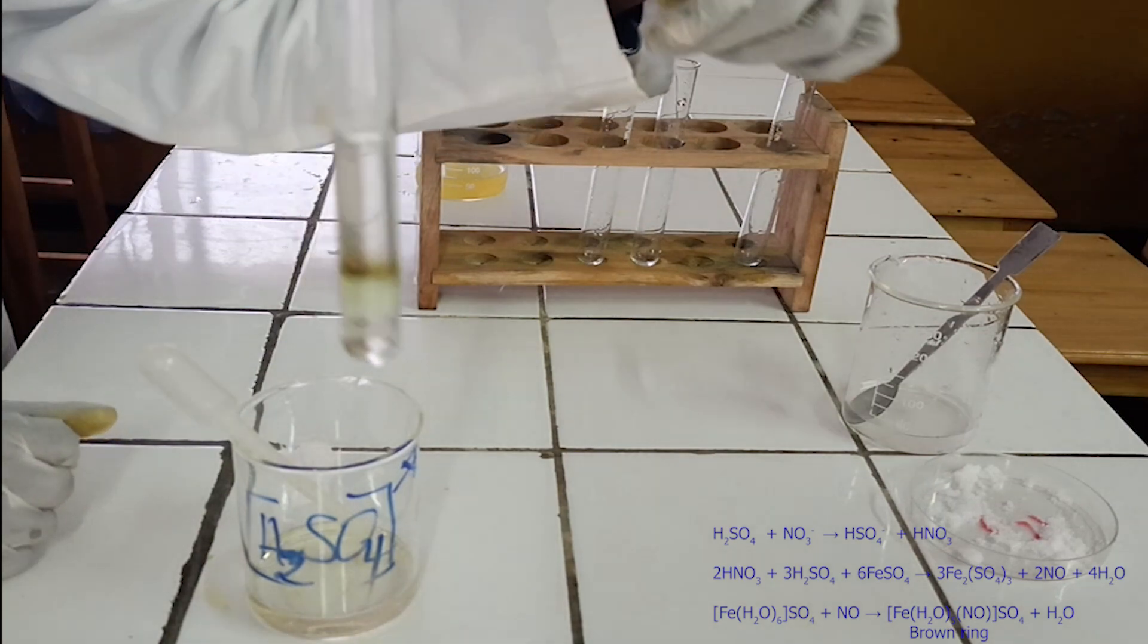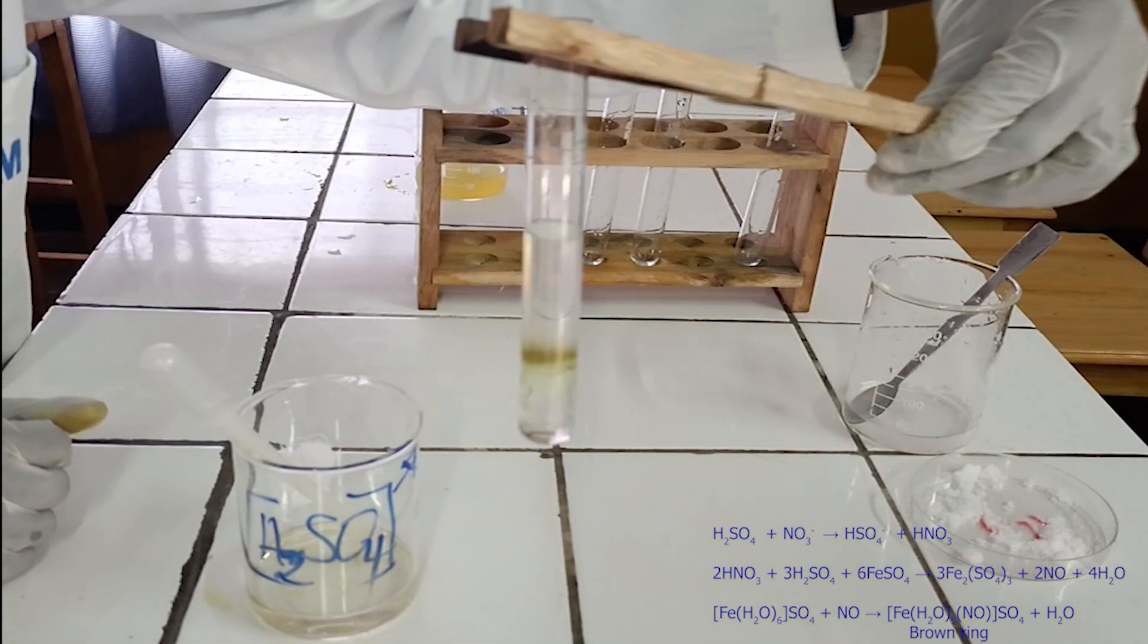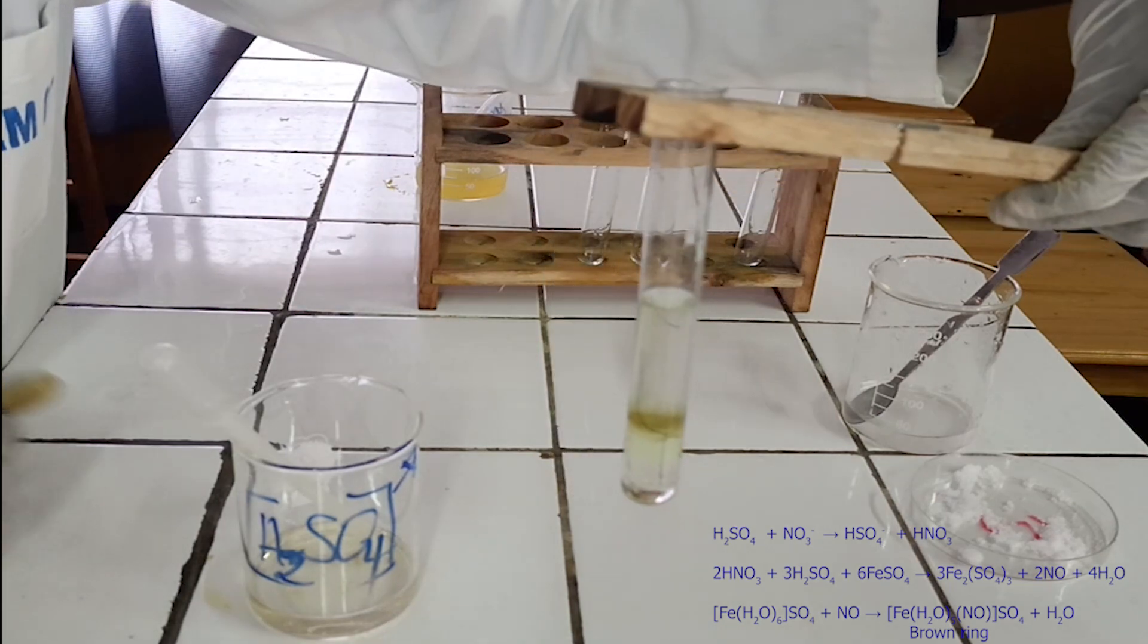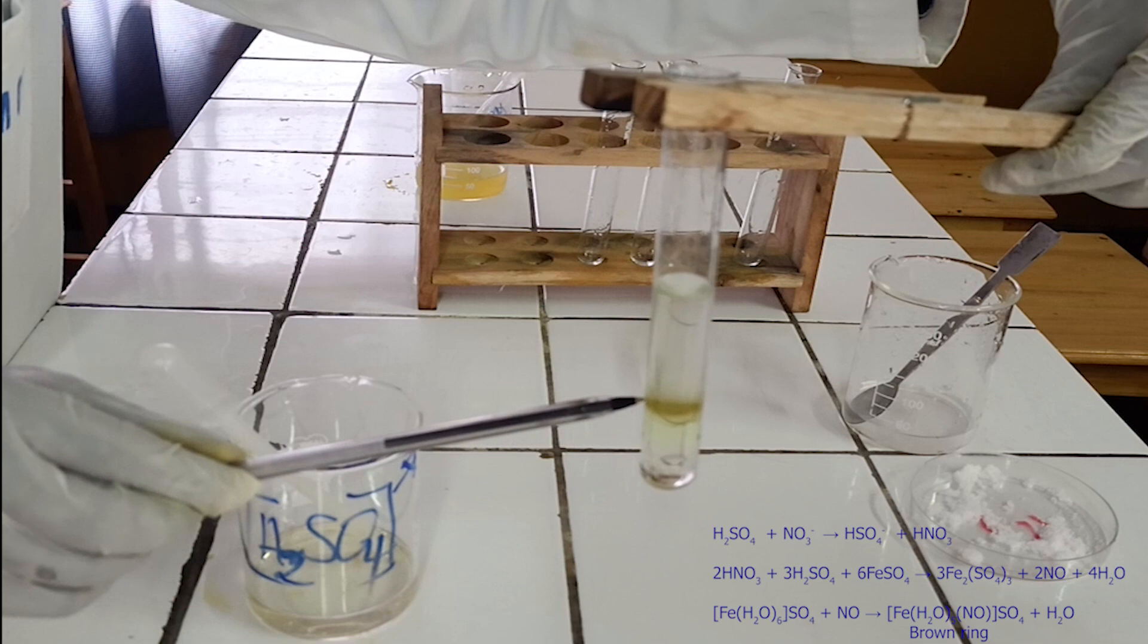The brown ring test or nitrate test is a reduction reaction. The nitrate is reduced to nitrogen monoxide by iron-2-ion from iron-2-sulfate.